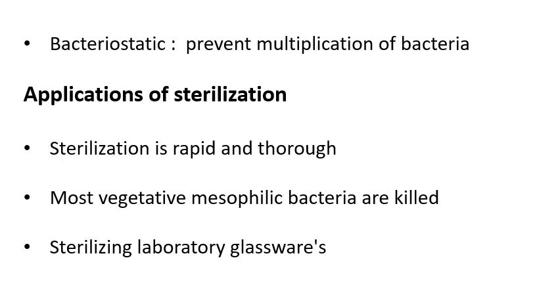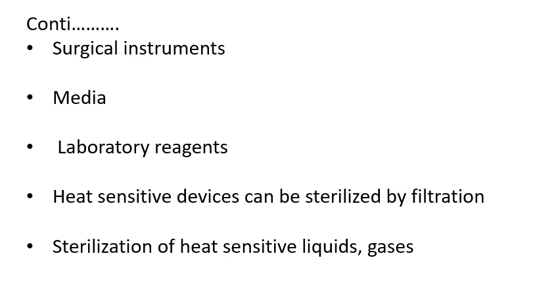And this sterilization can be used to sterilize laboratory glasswares, and surgical instruments can be sterilized. Media which is used in the laboratory can be sterilized by the sterilization process. And laboratory reagents, different reagents can be sterilized. Some of the heat sensitive devices can be sterilized by filtration. That means some of the chemicals or some of the liquids which are heat sensitive.